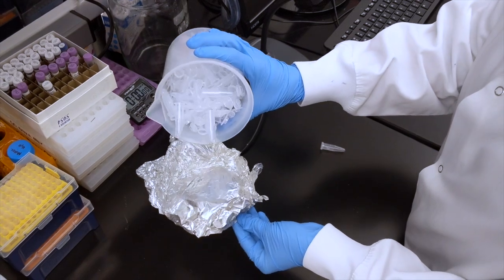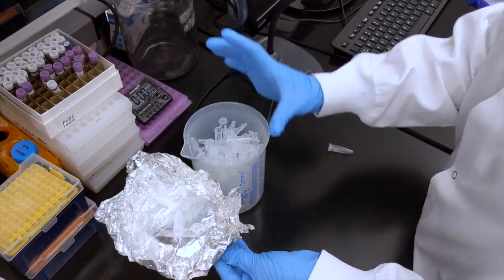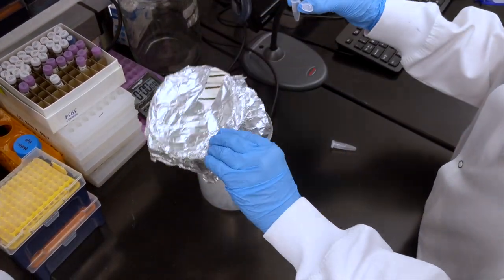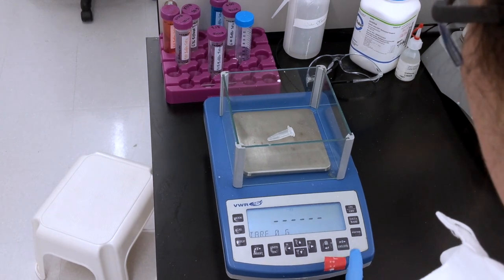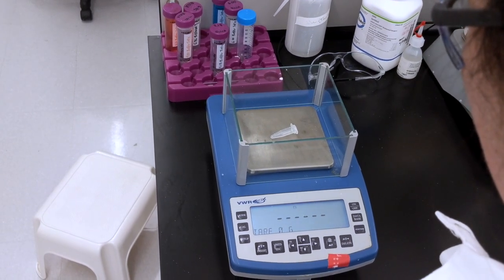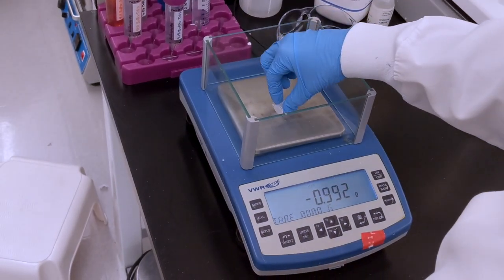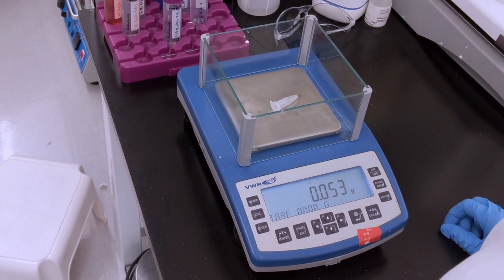Next, the gel fragment must be weighed to determine the amount of each buffer to add during the DNA isolation step. First, blank the scale with an empty microcentrifuge tube. Once the scale is blanked, weigh the microcentrifuge tube containing the gel slice.